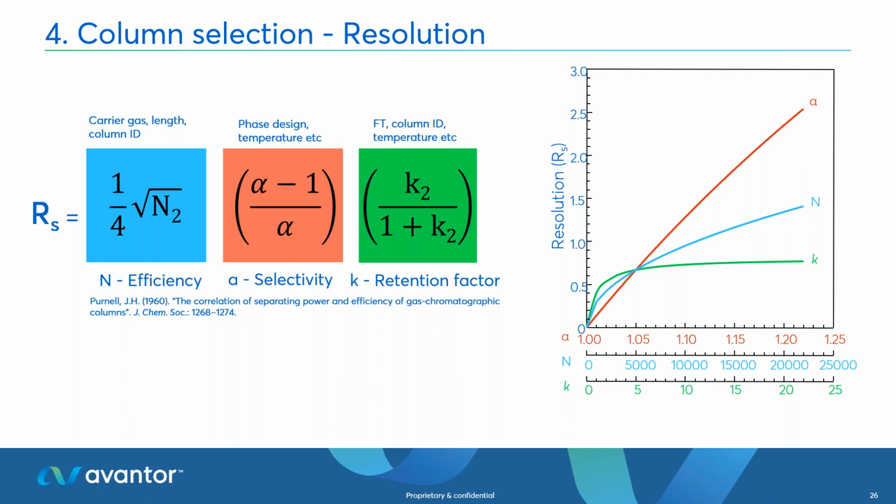So another question is around internal standards. Do you recommend using internal standards to improve repeatability of the percent RSD on the peak area for the system suitability?